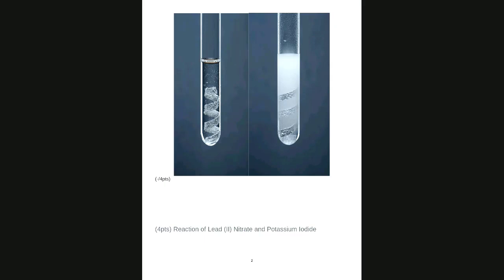And they give you this image here in your report. What do you see? There's a colorless solution. Then there's a silver metal in it. Right. So here, this is the reaction of magnesium. They will tell you magnesium reacts with hydrochloric acid.